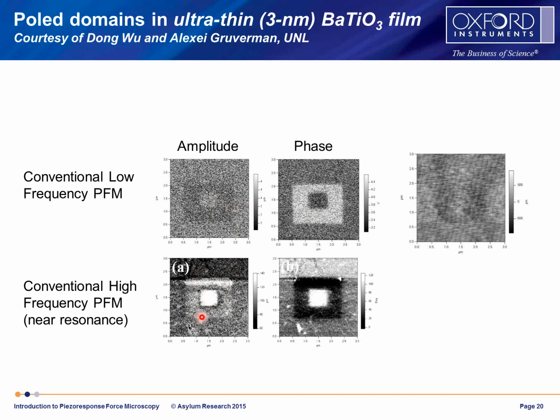The signal to noise is much higher. You can see structure in the amplitude here. But because the contact resonance is also playing games with this, it's not a very clear differentiation of the different domain types. They don't match. There's streaks. There's other artifacts coming through. So actually interpreting this data becomes difficult.